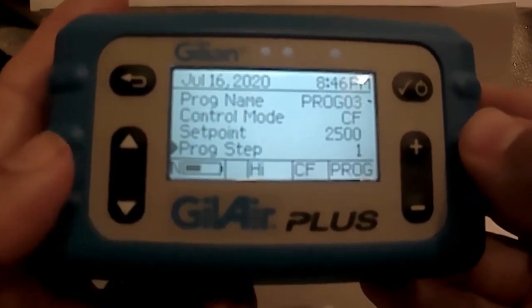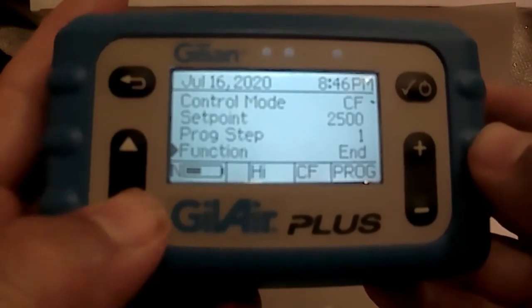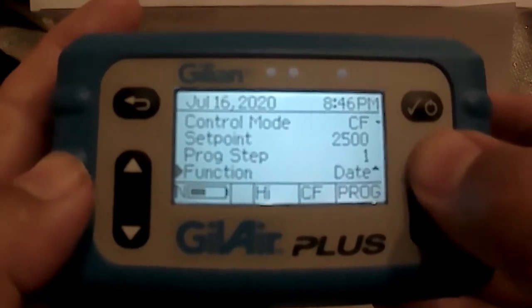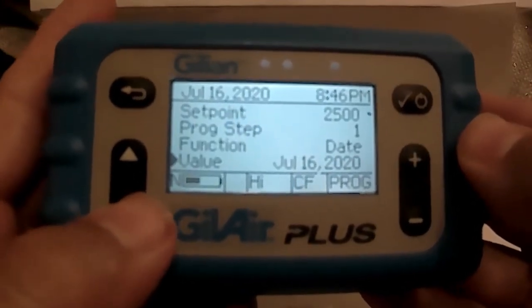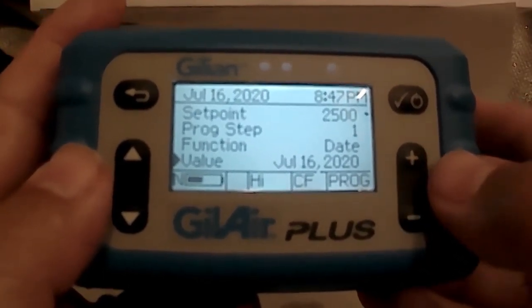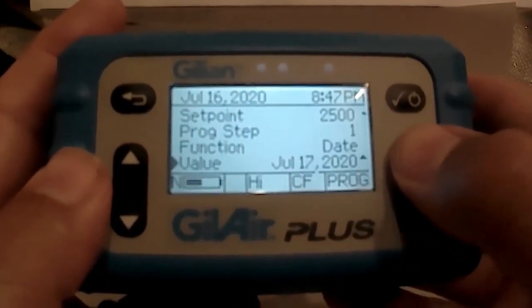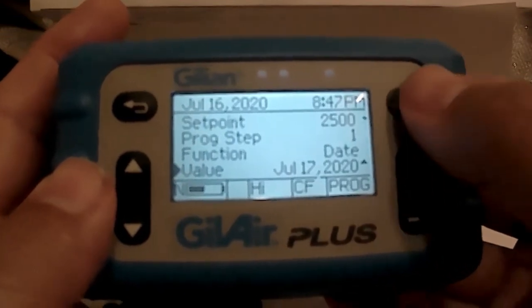I will now arrow down to program step. Since we're just beginning our program, we'll leave it on program step one, then arrow down one additional time to function. Because we want to start on a specific date and time, we will start by selecting date, hit enter, and arrow down one time. You will see the value with today's date, which you can alter to the date you want. For this purpose, let's set it to begin tomorrow morning at 9am — I've now changed it to July 17th and I'll hit enter to save that date.